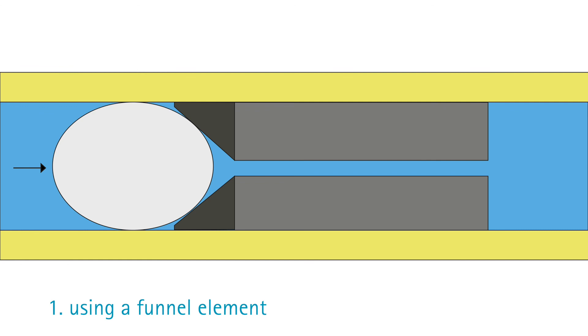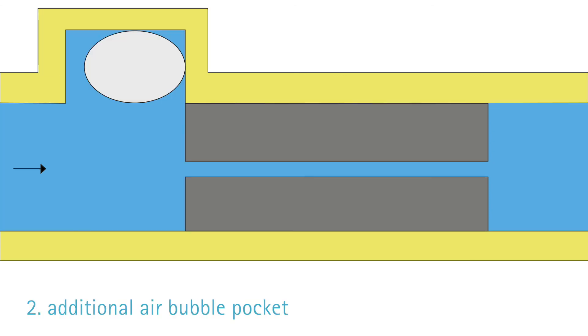A funnel element allows the deformation of the air bubble as it passes through. Or bubbles may be pushed into an additional air bubble pocket where they cannot block the restrictor.